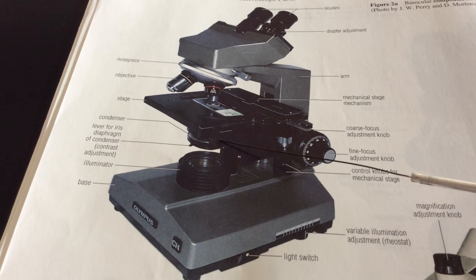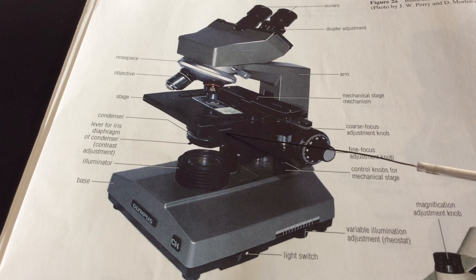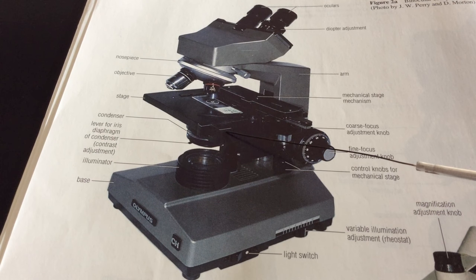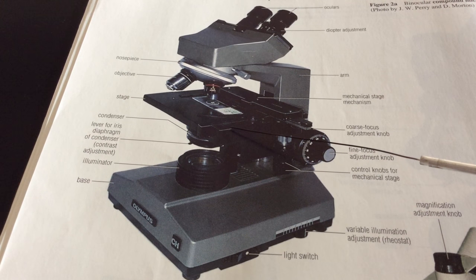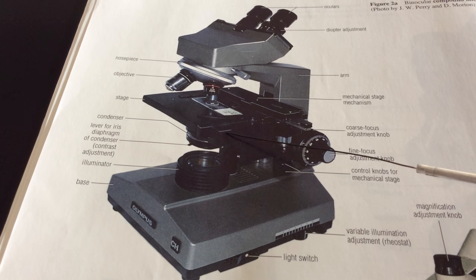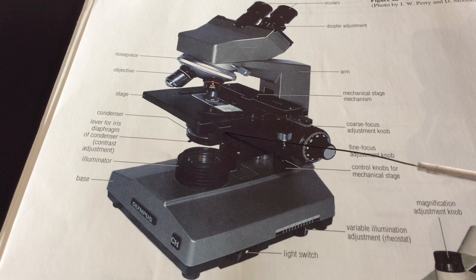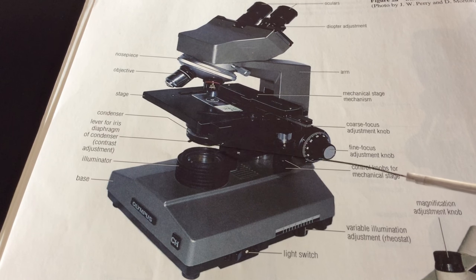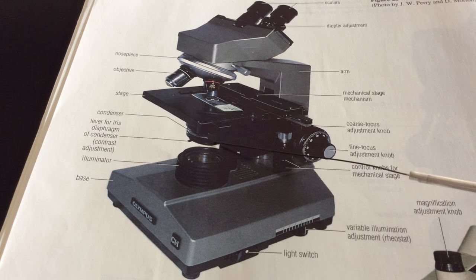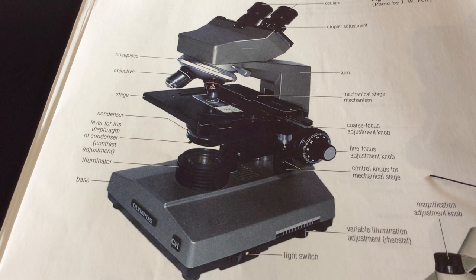We also want to raise the substage condenser as high as possible, and that'll focus light on our specimen. If, in contrast, we want to increase contrast, we're going to do the opposite. We want to decrease the amount of light striking the specimen. We're trying to increase the difference between the specimen and the surrounding. So to decrease light and thus increase contrast, we can lower the substage condenser, close down the iris diaphragm using the lever, and reduce the light using our variable light control or rheostat.